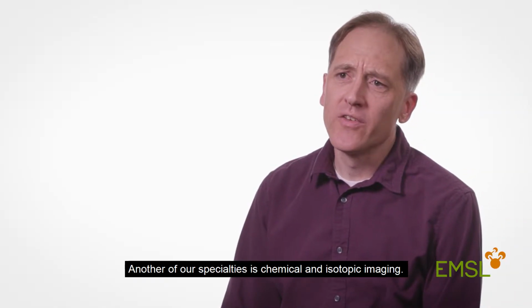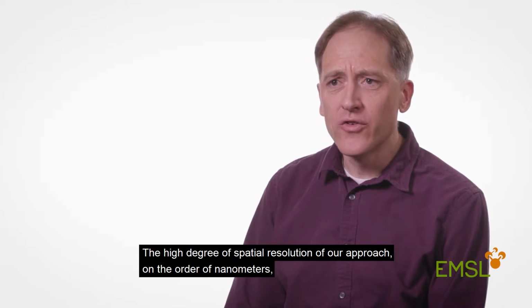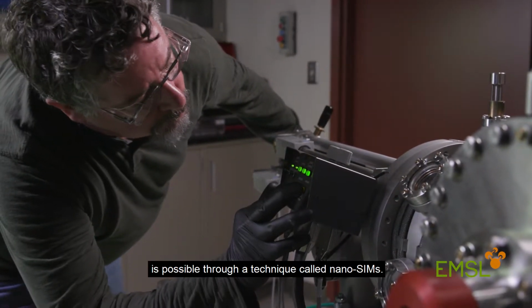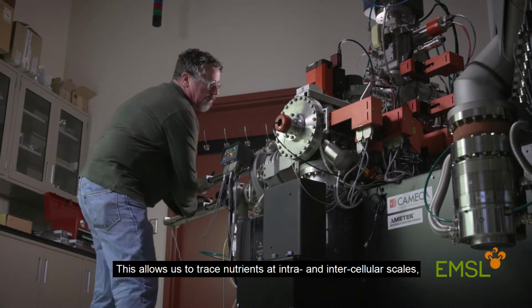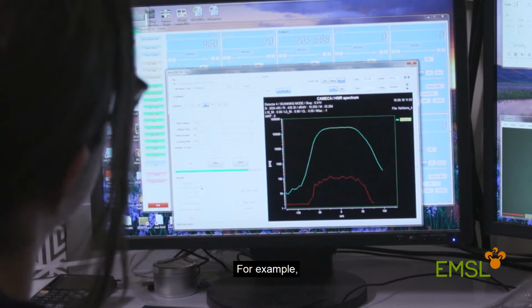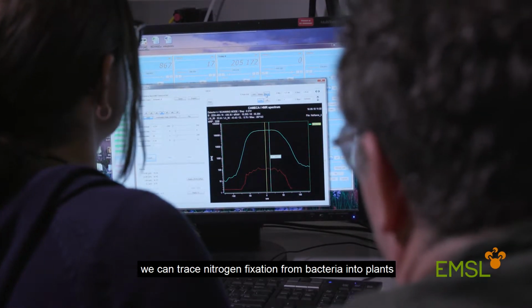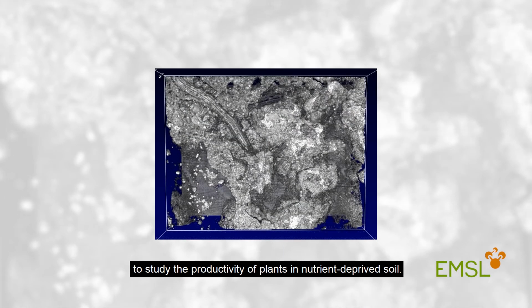Another of our specialties is chemical and isotopic imaging. The high degree of spatial resolution of our approach, on the order of nanometers, is possible through a technique called NanoSIMS. This allows us to trace nutrients at intra- and intercellular scales, as well as between organisms and their environment. For example, we can trace nitrogen fixation from bacteria into plants to study the productivity of plants in nutrient-deprived soils.